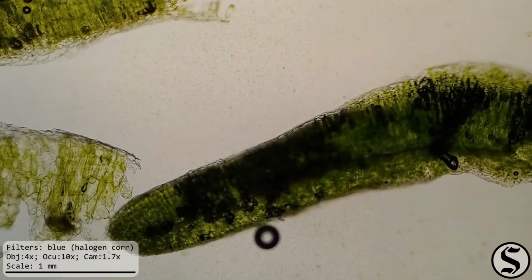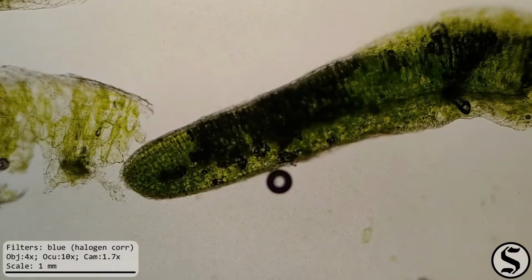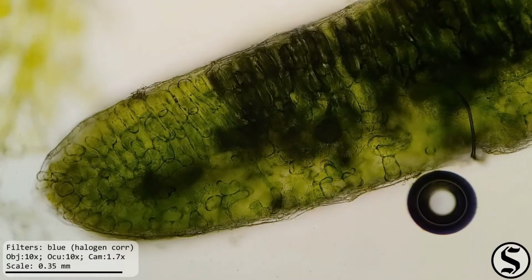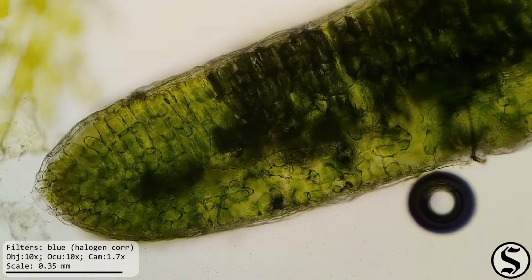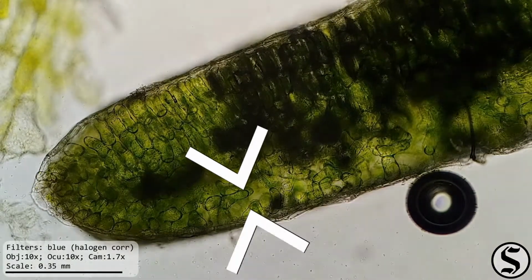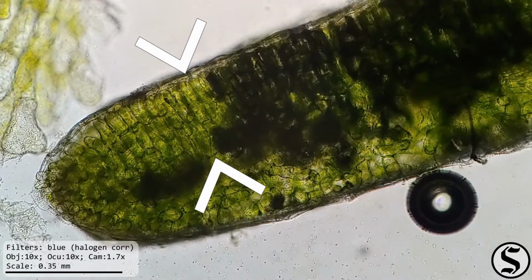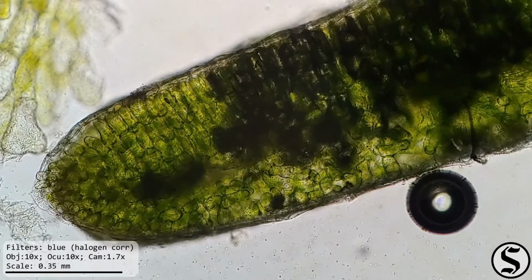This one has the cells oriented in the other direction, so I think this is exactly what we're looking for. Yes, we're looking at a slice from the side. So we can see that we've got kind of this grayish layer going all the way around, some globular cells above that, and some stacks of cells above that. So this is exactly what I was hoping for. We can see some distinct regions in the leaf.